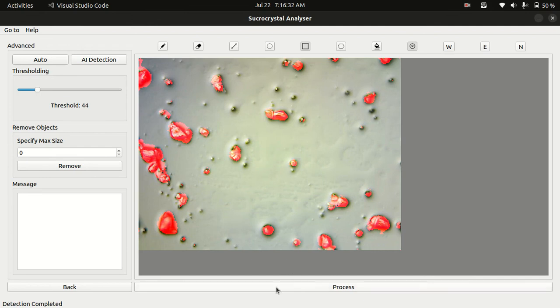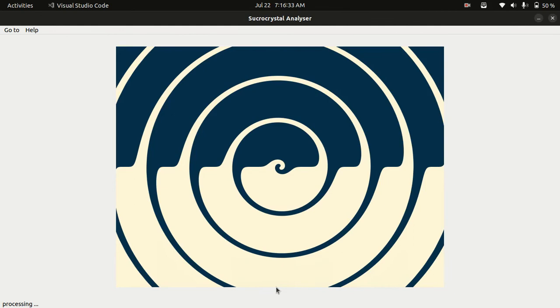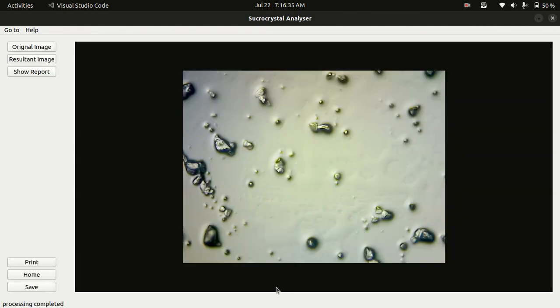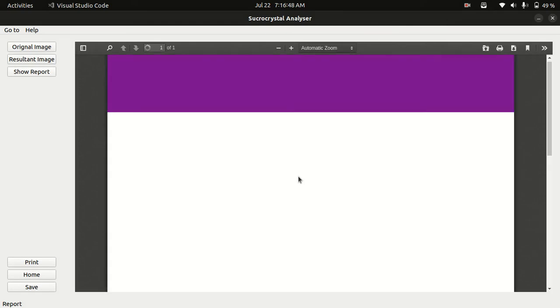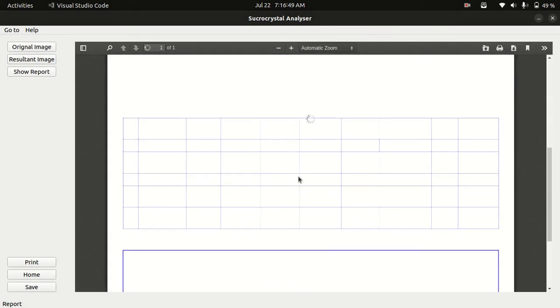We can click the process button to process the image. Here is the original image. We can see the resultant image here. You can see the image type and size of width in microns. We can also see the report here.